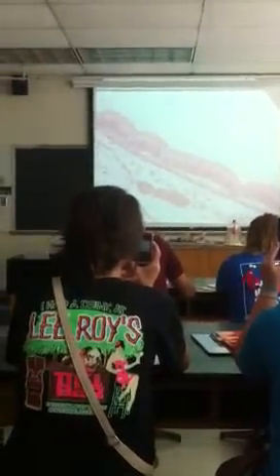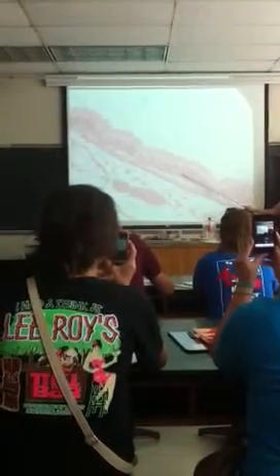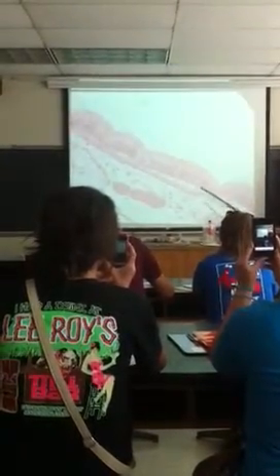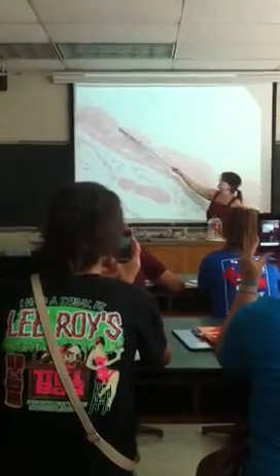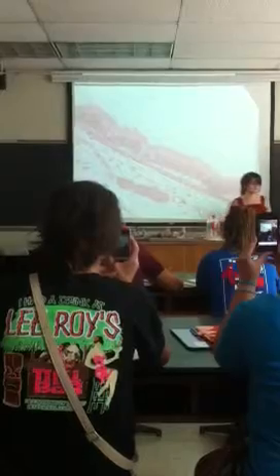I'm going to zoom in real quick just so you can see the cilia. I'll zoom back out a second. Okay. So it's a real close-up view. This is the pseudostratified columnar. And they call it pseudostratified because it looks like there's multiple layers of cells, but in fact it's just one cell layer thick. And you can see the cilia on the ends of the cells here.